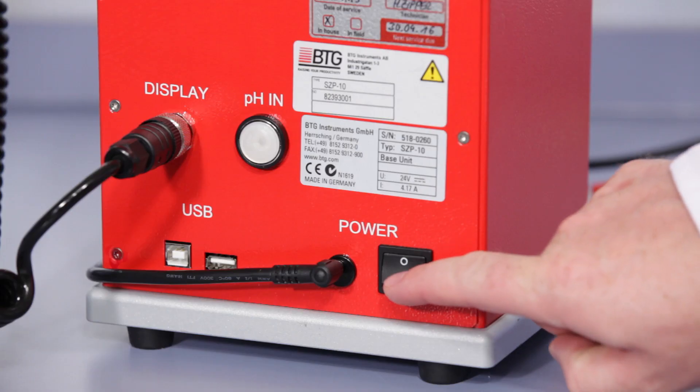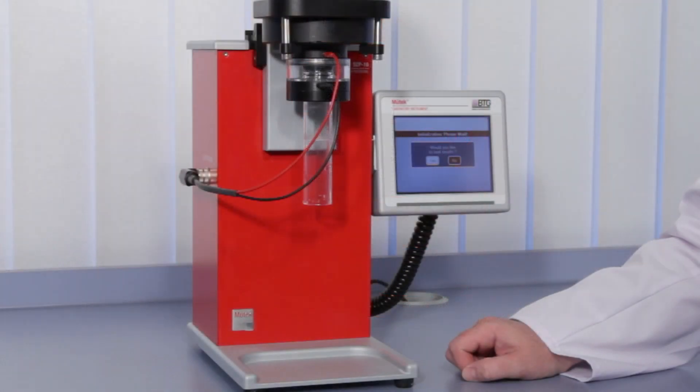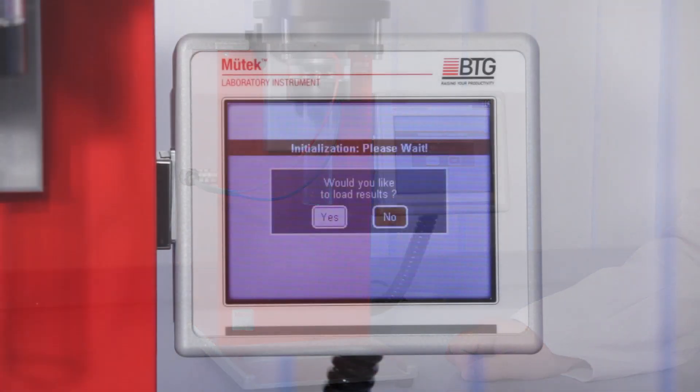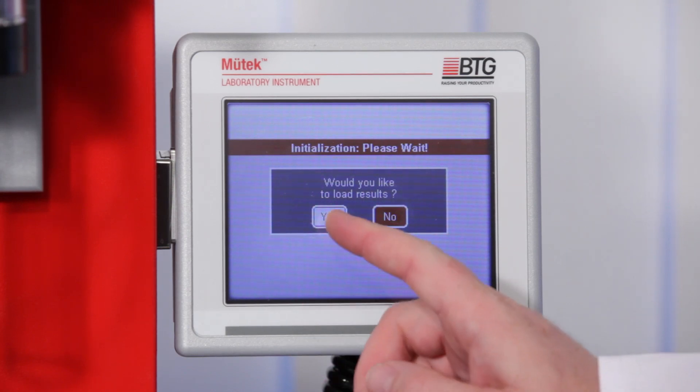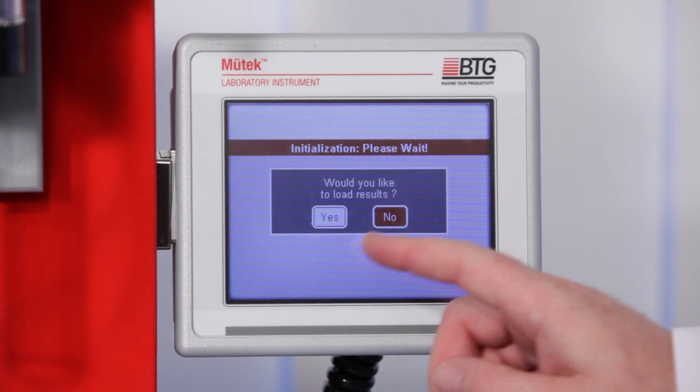Switch on the instrument. If you want to load stored data into the display, you can do it now. In this case, press Yes. Otherwise, press No.